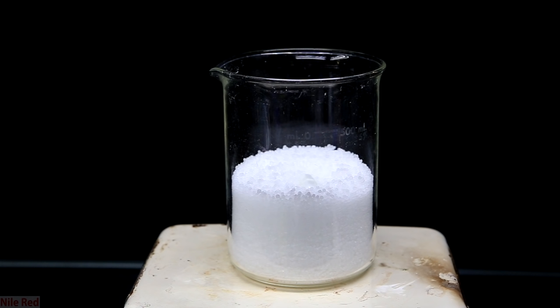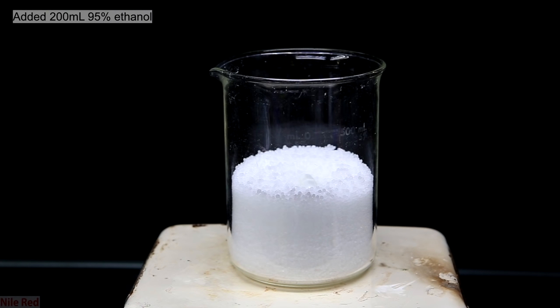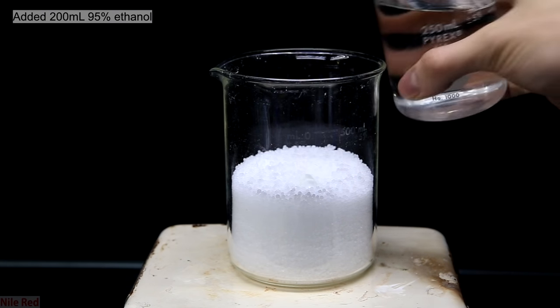However, luckily, most products have been already recrystallized and if you search online, you can probably find the ideal solvent. Online, I found that about one gram of urea dissolves in about one milliliter of boiling 95% ethanol. Given that I have 250 grams, I started out by adding 200 milliliters of 95% ethanol.